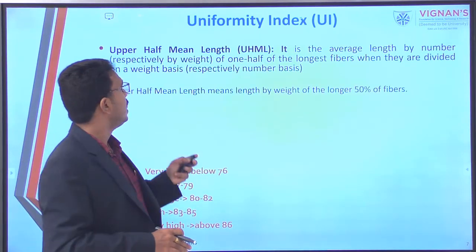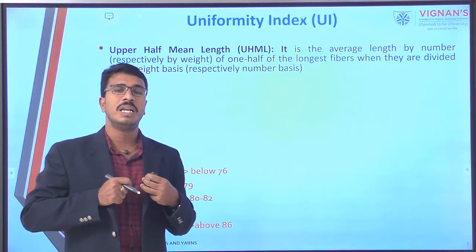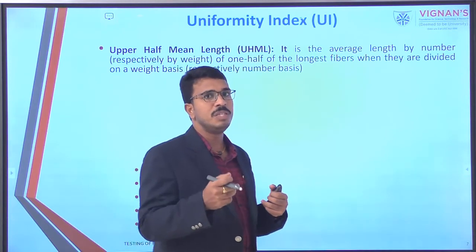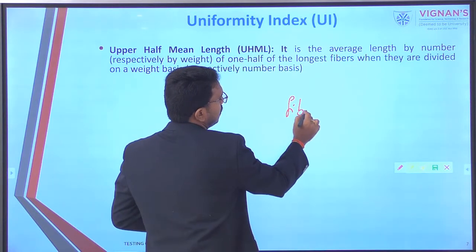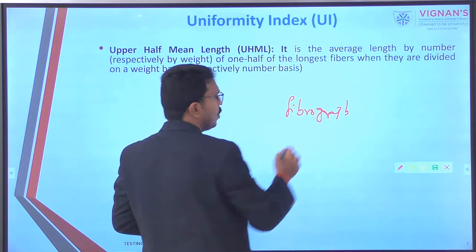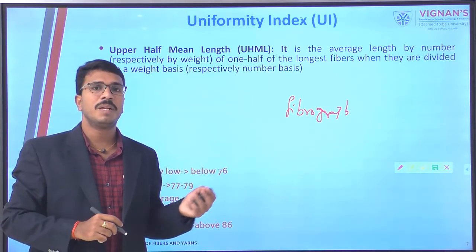Now, when it is coming to the length, by finding out the length, that is fiber length. In order to find out this fiber length, this high volume instrument is provided with an inbuilt fibrograph, which we have already discussed in the previous classes.